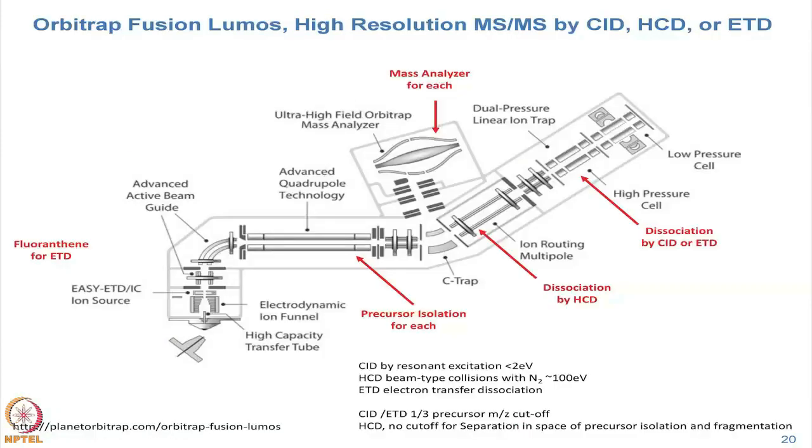This is one of the most desirable instruments, but it's most desirable only if you can afford it. It's one of the most expensive instruments, and it can do a whole lot of things. The CPTAC program is currently generating almost all of its data on this kind of an instrument, but we don't use the entire capability of the instrument.